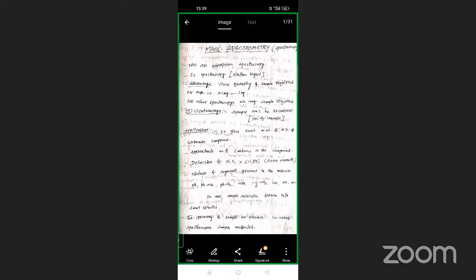For benzyl you will get the signal at m/z 91. For acetyl you will get the signal at m/z 43. For phenyl you will get m/z 77. So like that you can easily find out the fragments here.